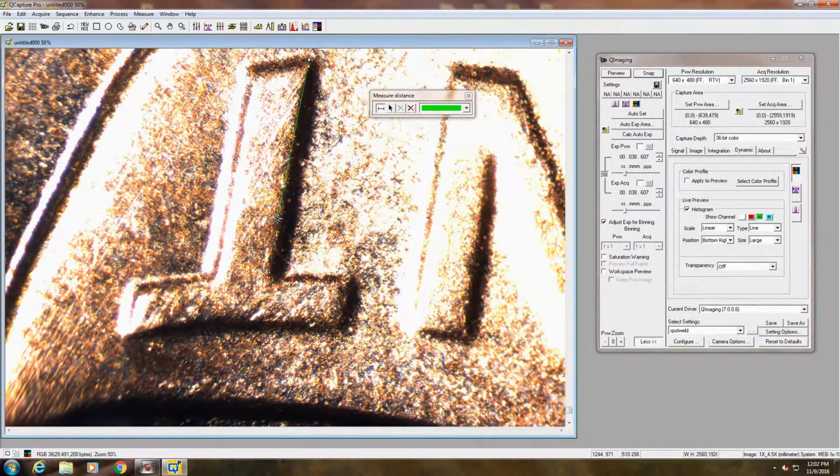Try to get it as close as you can. I'm actually measuring the penny kind of by where the raised portion of the T begins. And the same thing with here. You kind of have to look closely depending on what the shadows look like. And then you get your measurement right there. And then if you need, in this case, I'm going to actually do two or three. Give me a second. I'm going to do it on the other side.